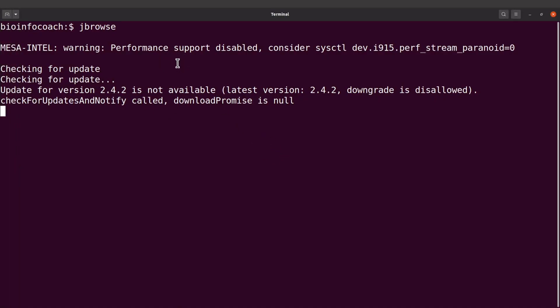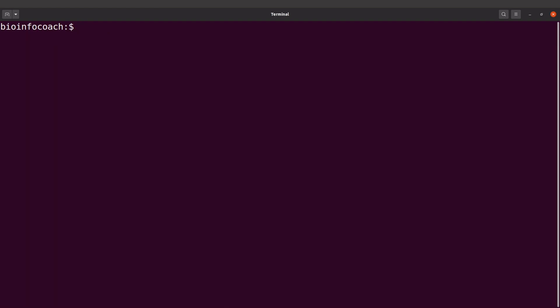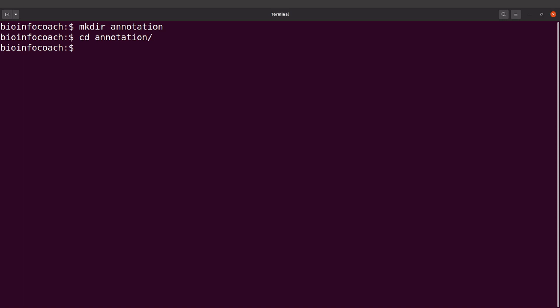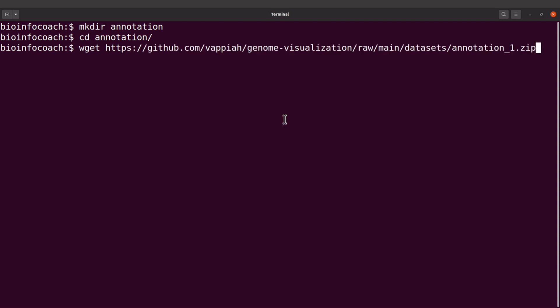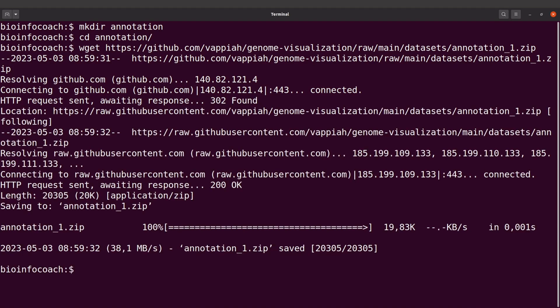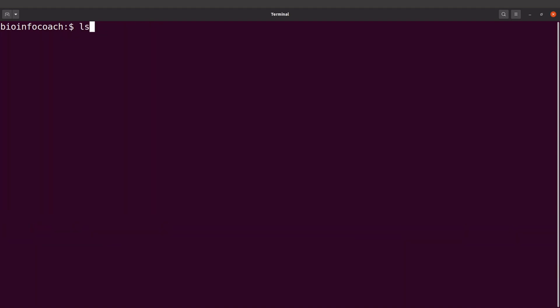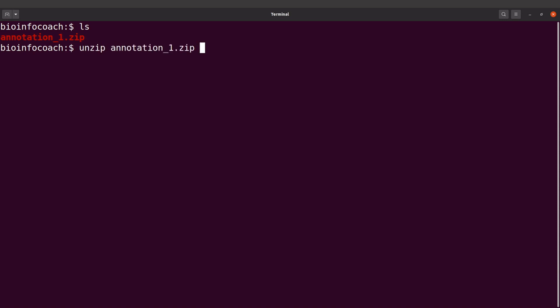Move to a terminal that doesn't have JBrowse active — open a new terminal. I'll first create a directory called annotation, cd into it, then download the example data using wget with the download link. Once downloaded, let's do an ls — it's a zip file so we need to unzip it: unzip annotation1.